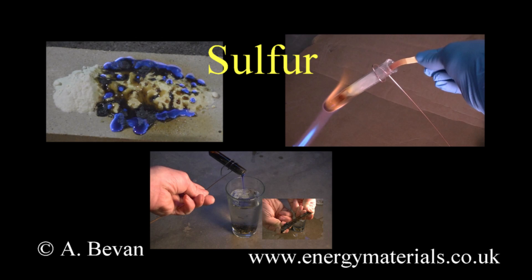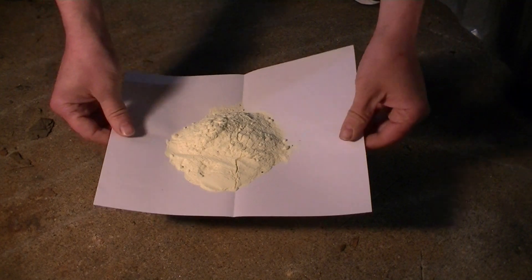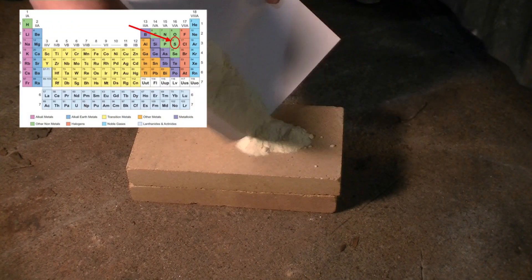This is a short demonstration video looking at some of the characteristics of elemental sulfur. Sulfur is a non-metal and the 16th element found in the periodic table.